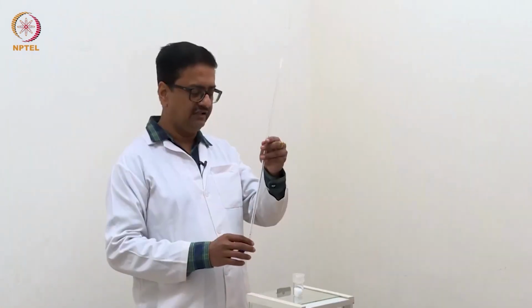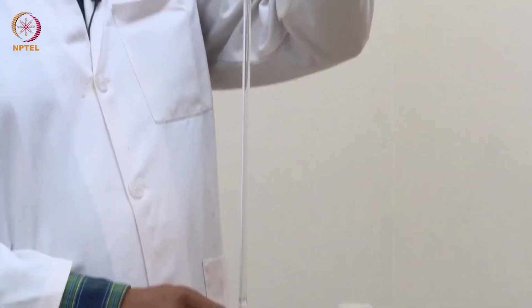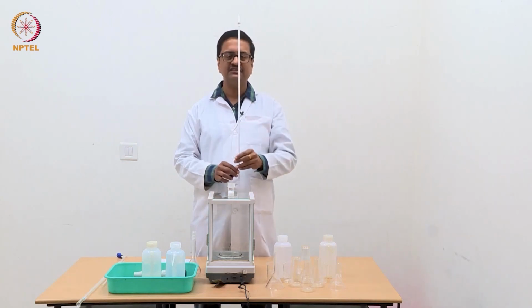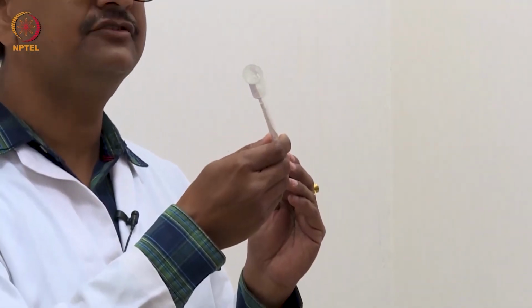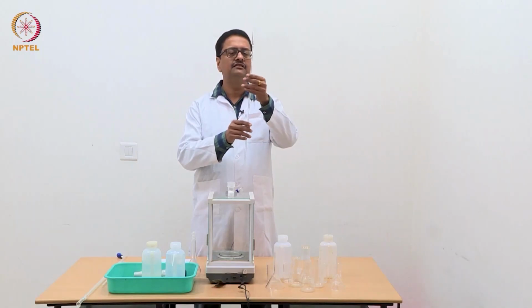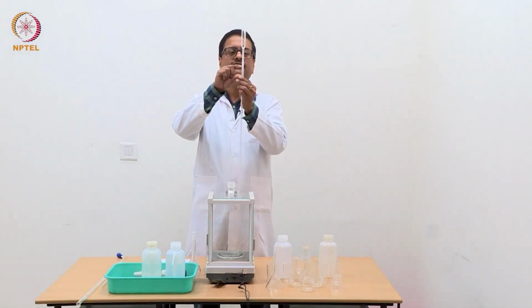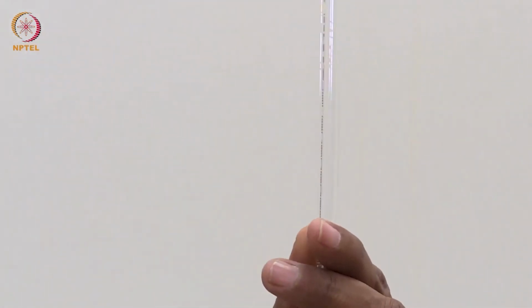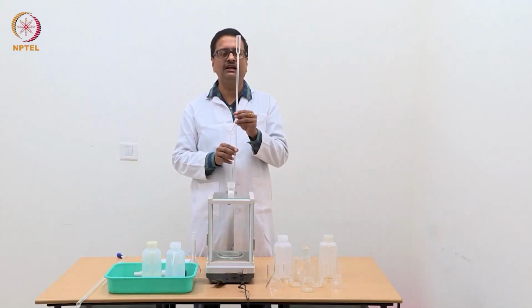We have another burette here, which is a 10 ml burette. You can see the length of the burette is almost the same as that of the 50 ml burette, but its capacity is only 10 ml, which essentially means the bore size is very small in this particular burette. So 1 ml is measured in this wide region with a gap of 0.2 ml, and every smallest division in this burette measures 0.02 ml.